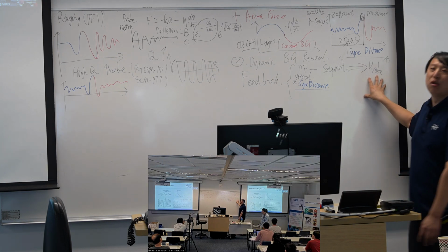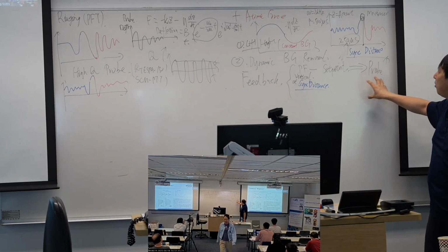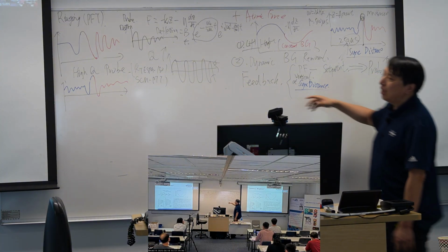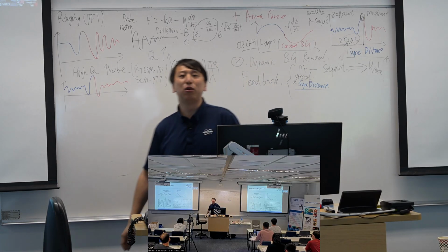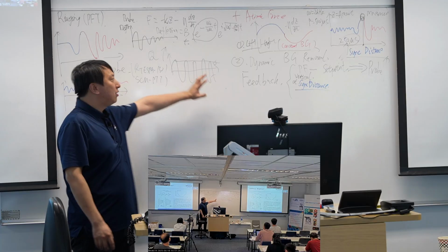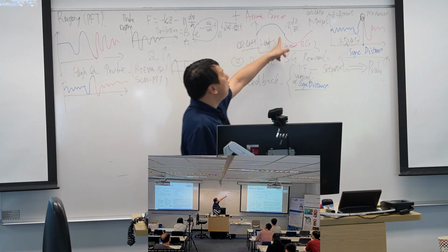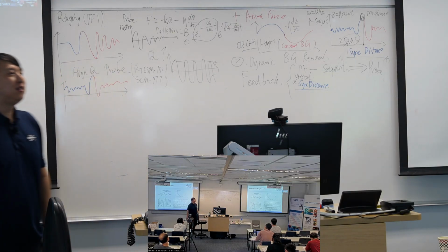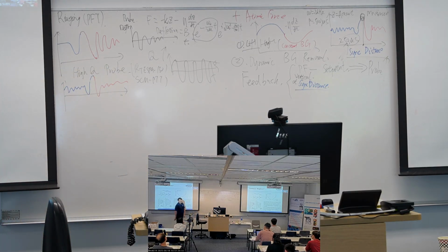It can give me the probe position, and from the probe position, I can get the morphology. And since it's a sine wave, the speed will be 0 when I reach the lowest point. Then it's good to go. Then the game is done. So that's Bruker's PeakForce tapping.